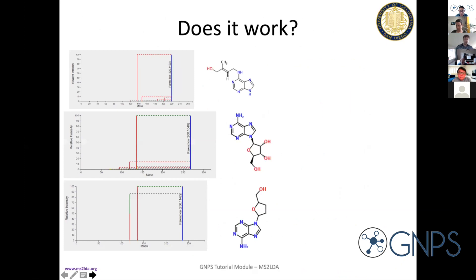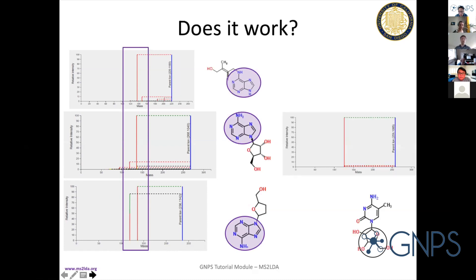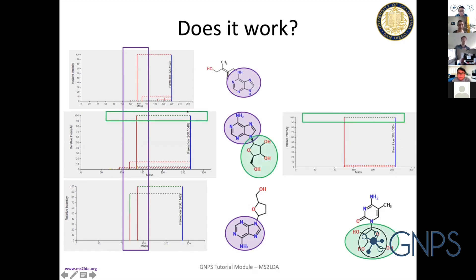Does it work? Here we have an example of standards from GNPS, and they all share this adenine core molecule. MS2LDA was able to group the spectra of this molecule into one master motif, where there are two peaks. It doesn't need to be exactly the same pattern across the multiple spectra, but they all refer back to this adenine core molecule. We also see a green loss that is present across multiple documents, relating to the sugar part of the adenosine molecule — attached to a different core as well, and the two things combined actually allow us to build up the adenosine molecule.